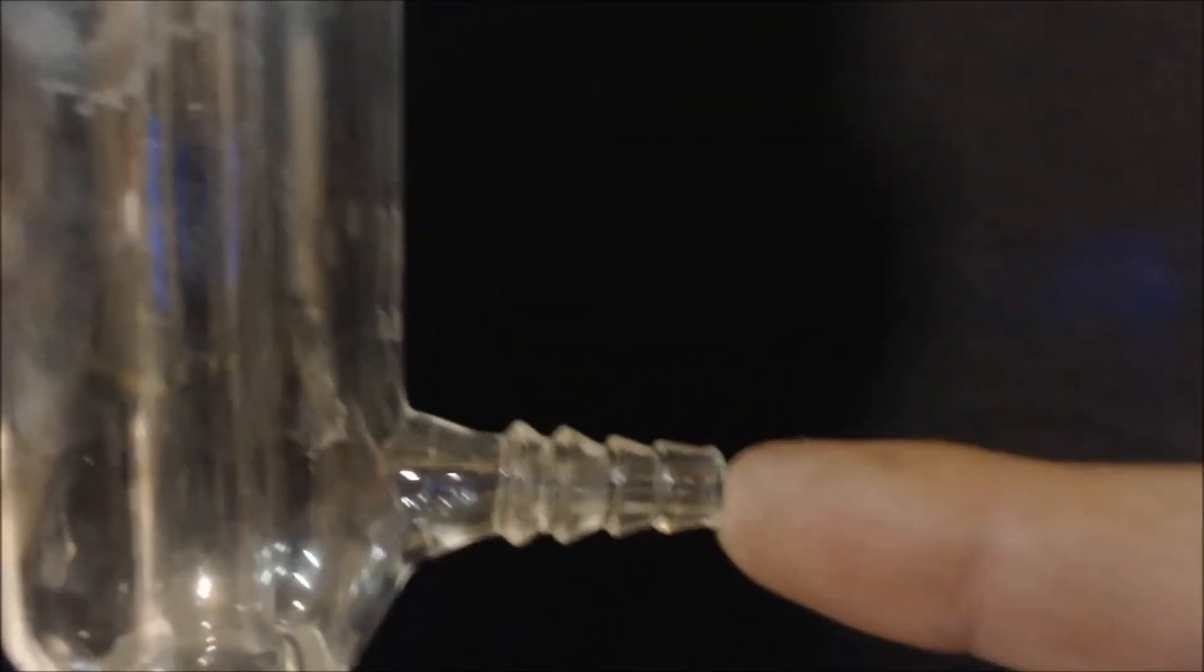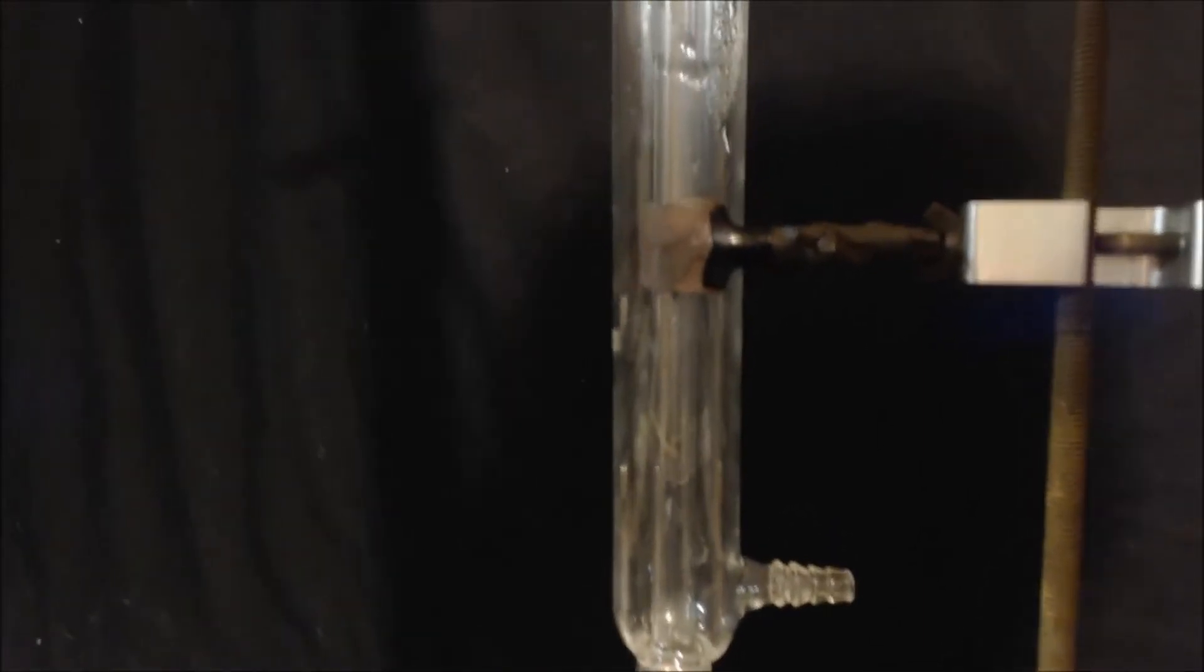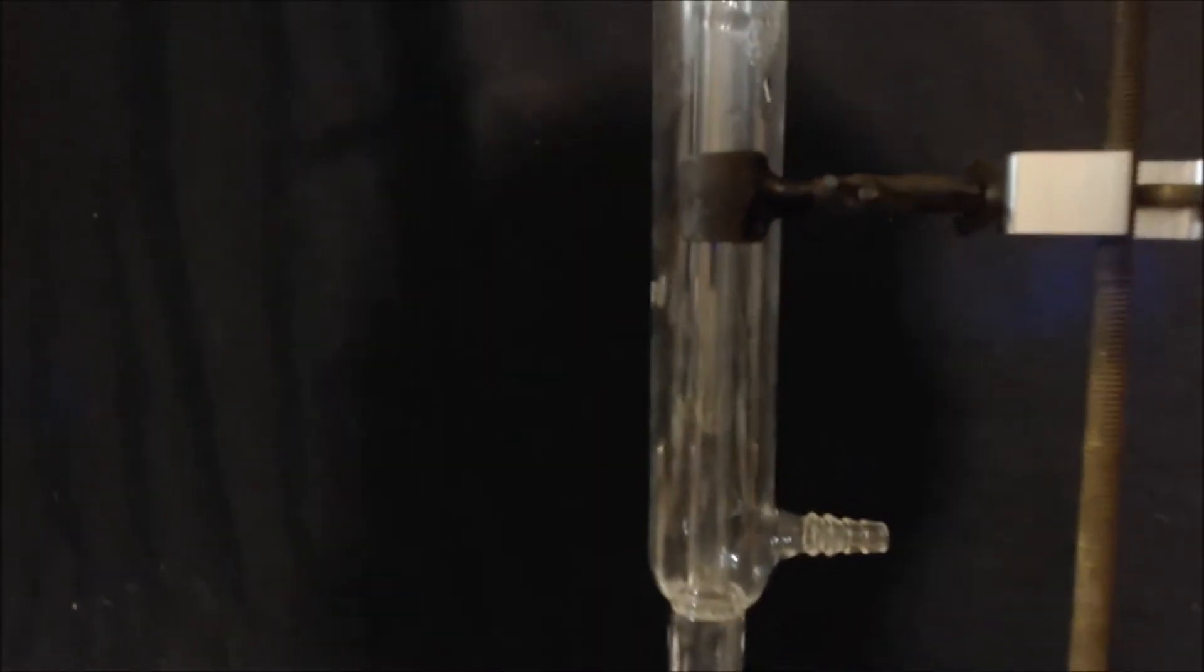Basically it's just a tube within a tube. The inner tube is where the gases come up and the outer tube is where the water. I always put your water pumping up. And you can think of it, well why would I have a pump if I was just going to have it go down, gravity will take it down. I always think of that because no matter how you set up your apparatus for whatever it is, you always pump up. You pump the water in and up.